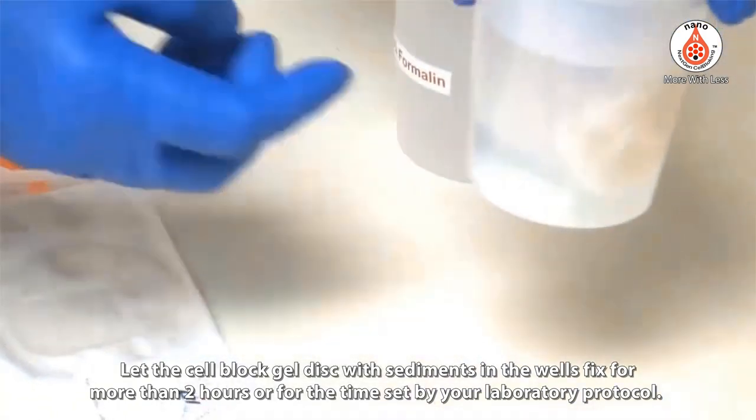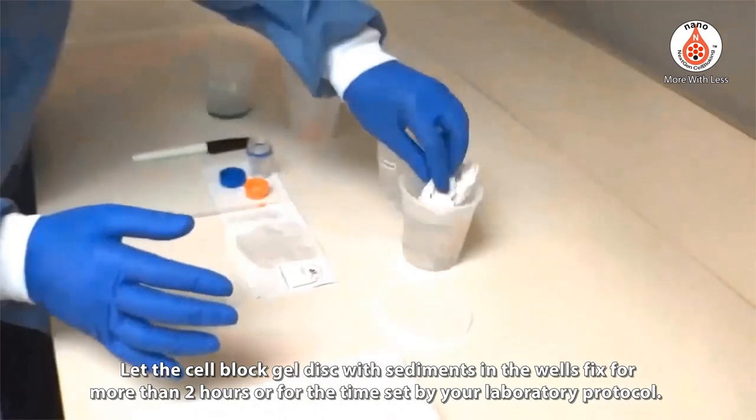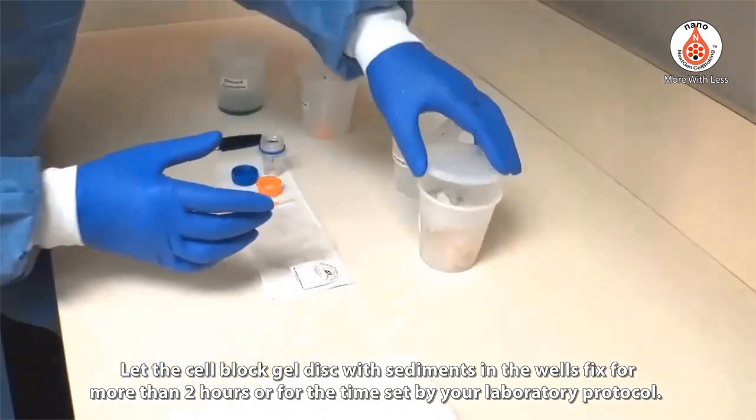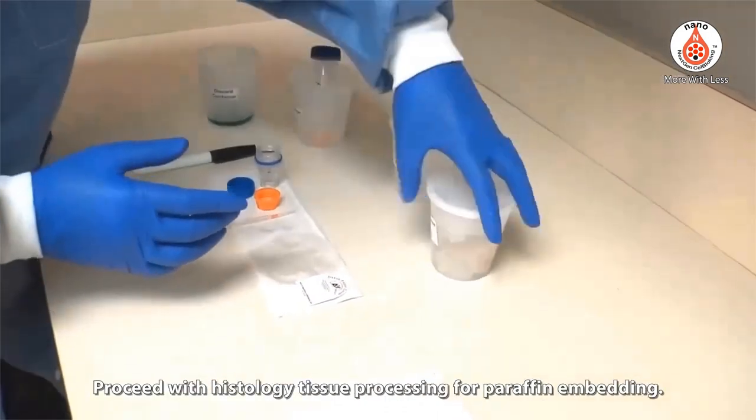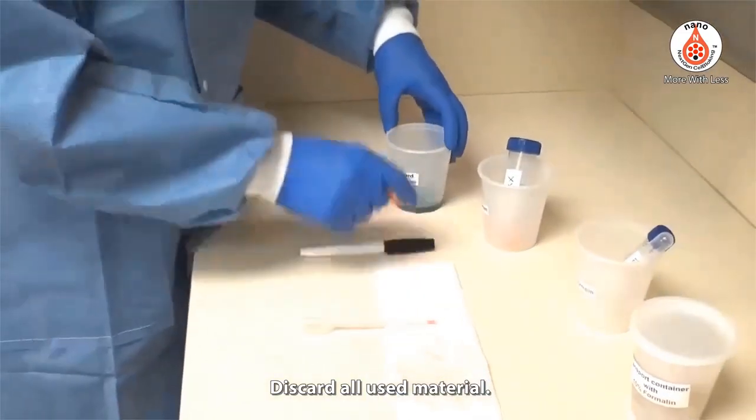Allow the cell block gel disc with sediments in the wells to fix for more than 2 hours, or for the time set by your laboratory protocol. Then proceed with histology tissue processing for paraffin embedding. Discard all used materials.